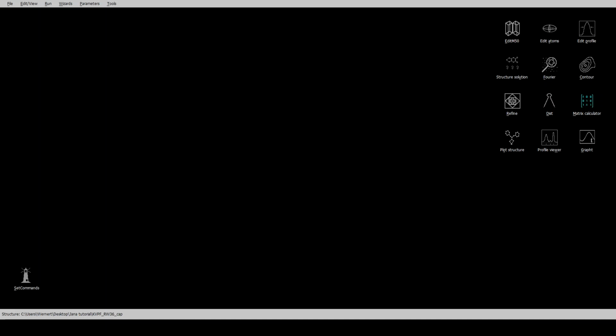Okay, so here is a short video in which I will try to show you how to use the software JANA2006. Basically, we'll perform a Le Bail refinement, or full pattern matching, on the XRD pattern. So here's the main overview.